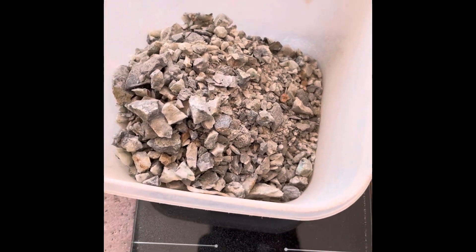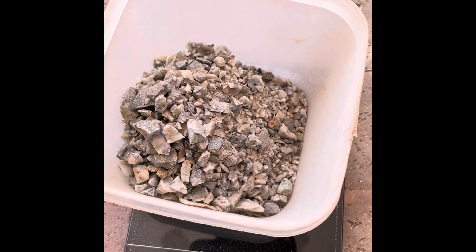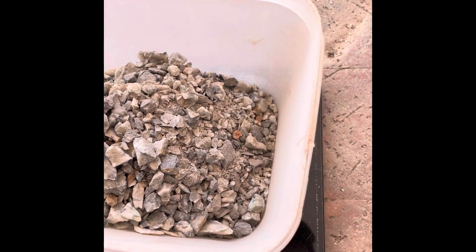All right, we got our ore in the bucket. Looks like we're two grams off, but that's probably within reason of the scale and the table that it was on. So we're going to go with 608 and go from here.